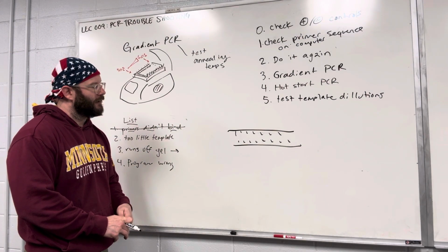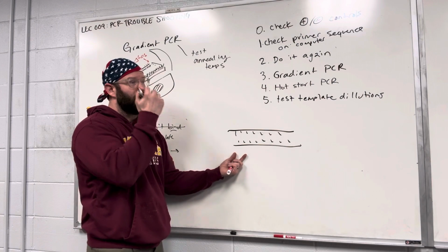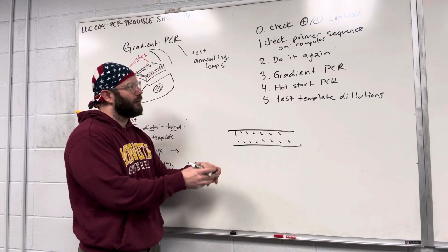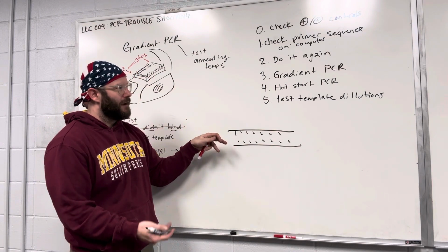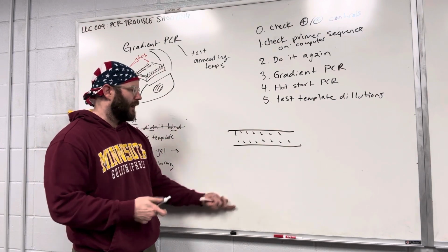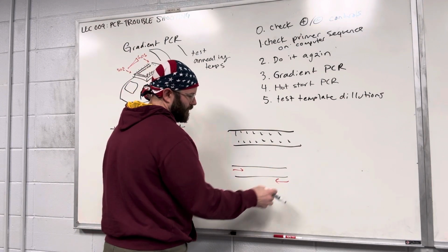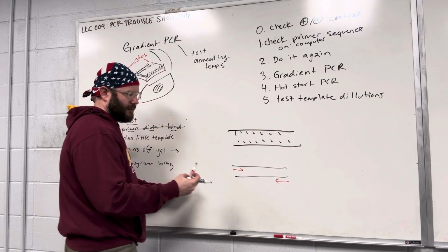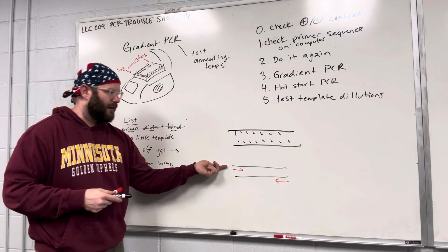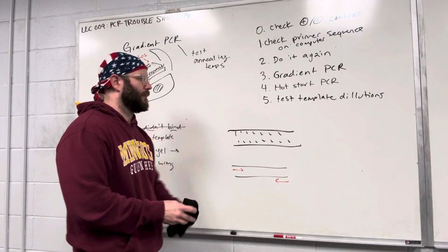The primers have a hard time finding the binding spot. Yes, okay, that's one. So for example, if you have extracted DNA from an entire organism, you have that entire organism's entire genome, and many primers have multiple sites that they can kind of bind to, okay? So they might have a real difficult time where the forward primer has to find and the reverse primer has to find, okay, to get the actual amplicon at the right size. So having too much DNA, that can make it harder for the primers to find their spot, okay? So what I often do is I test template dilutions.